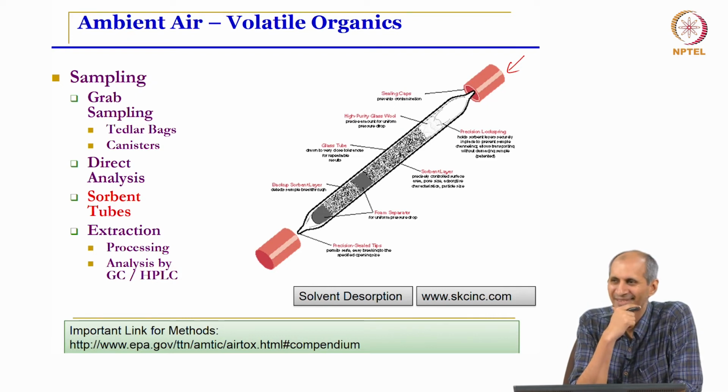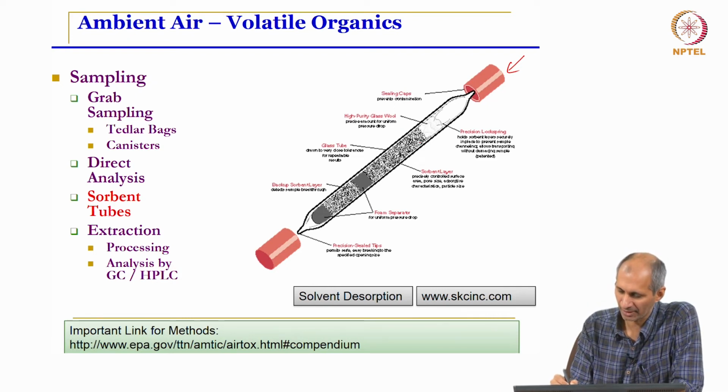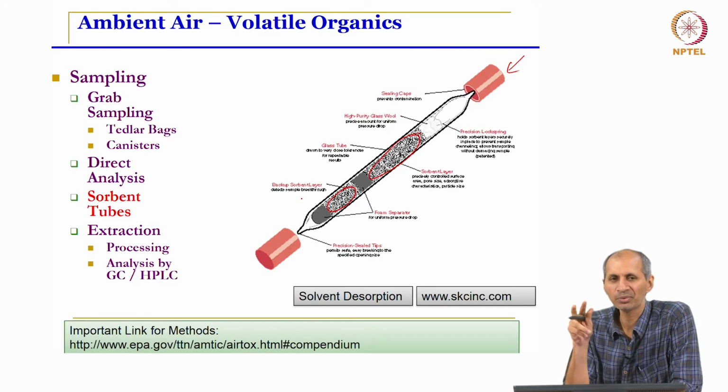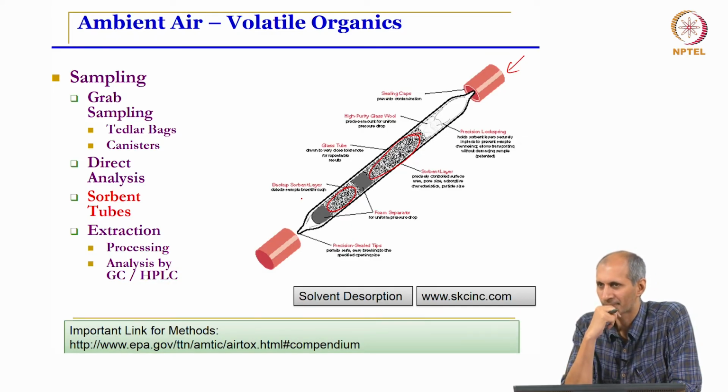Anything you notice? This is adsorbent material, this is adsorbent material. Why are there two sections?